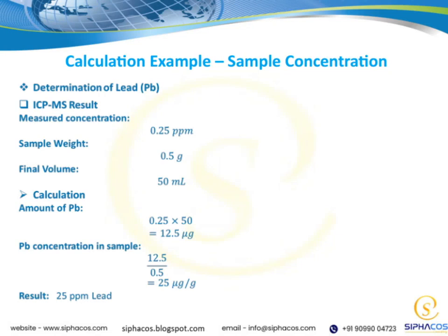Let's walk through a calculation example to find a sample concentration. This will help us see how the theory works in practice. By breaking down the steps, we'll understand how to apply the formulas and interpret the results. It's one thing to know the method, but seeing it in action makes it stick. So, let's dive into the numbers and get a clear picture of the process.